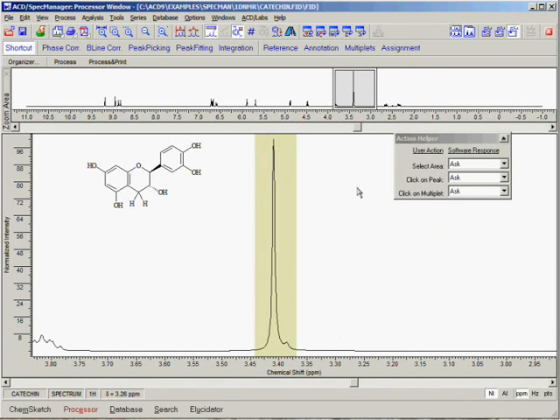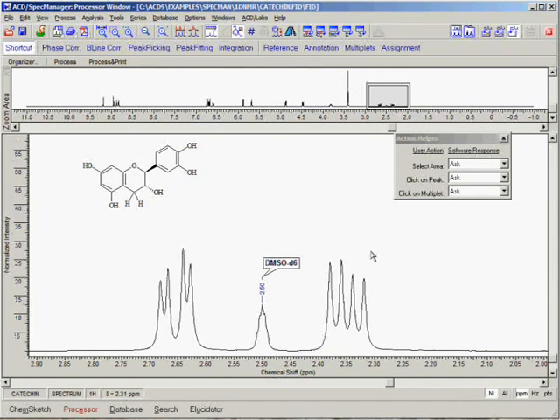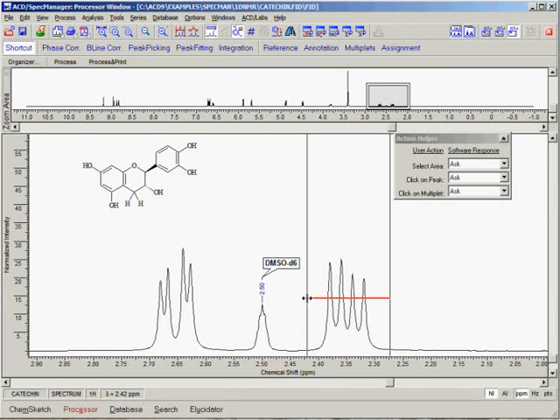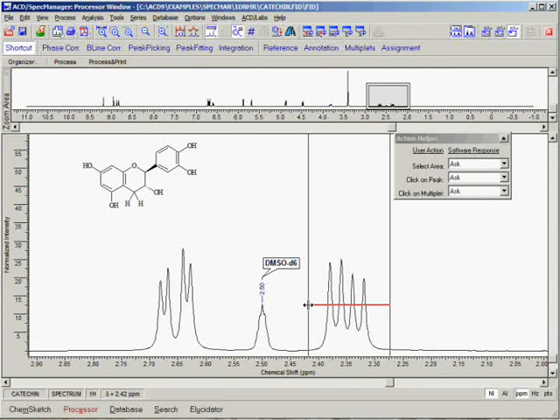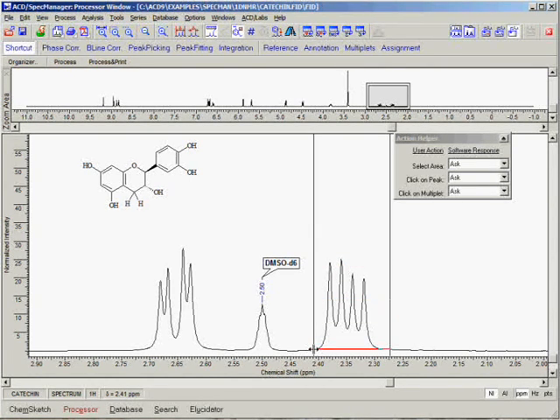Now we can identify the multiplets in this spectrum. You can work in any order you wish. Here we choose to begin with the multiplets on the right of the spectrum and work our way left. In order to create a multiplet, simply click and drag with the left mouse button over the peak of interest. Notice that as we drag across the peak of interest, a horizontal red line appears. The purpose of this line is to set the peak threshold. Note that if the red line is too high, peaks underneath this line will not be picked. On the other hand, if the red line is set too low, some extraneous peaks may be picked.